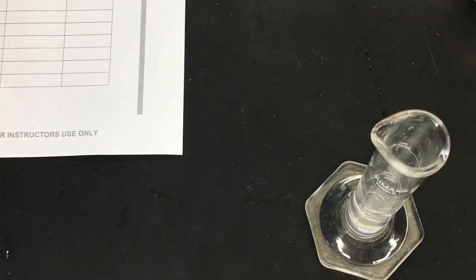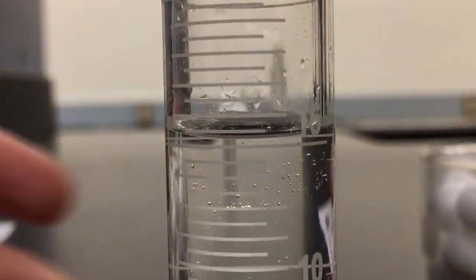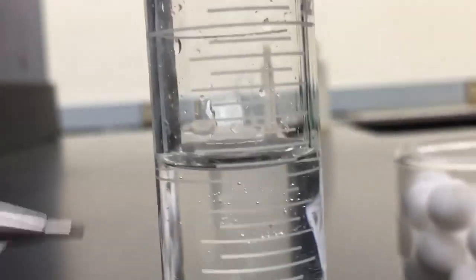And I'm going to see if I can show you really quick what I am looking at. Okay, so when I did my measurement, I got down here on one knee, and I got at eye level with this thing. And you can see the 15 mark, you see the 10 mark, you see the larger line that wraps around. It's kind of hard to see the background. Wow, and I can't do that with my left hand. Okay, we're having fun. All right, so there is the 15 mark. You see that line above it is the 16 milliliter mark?